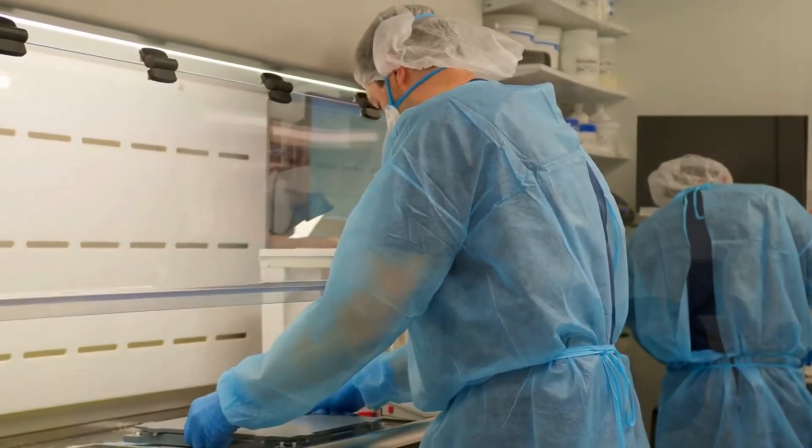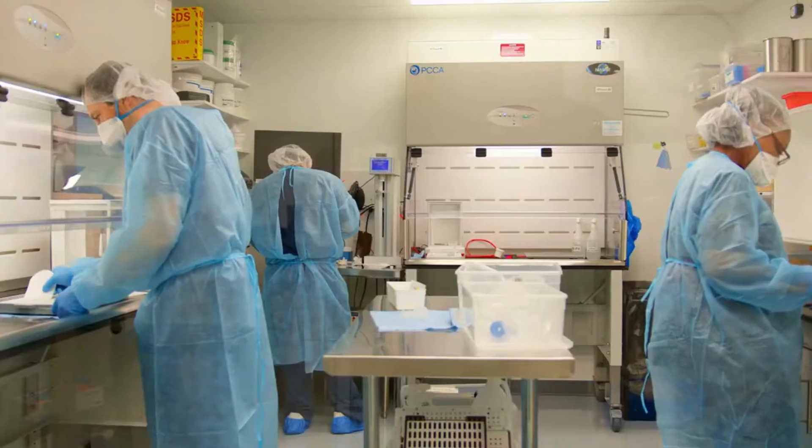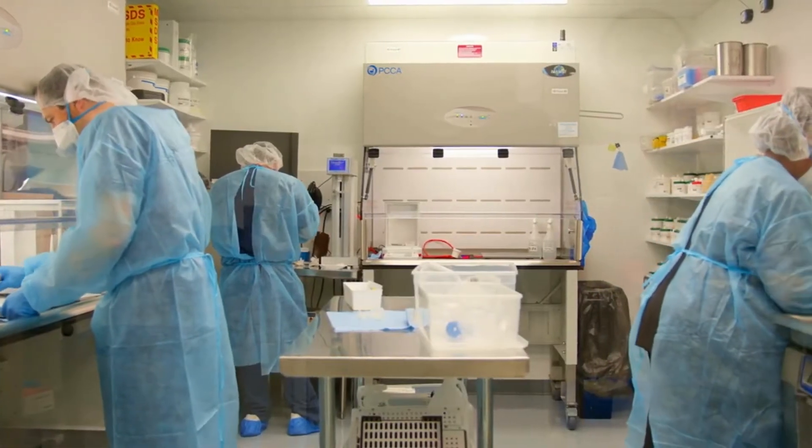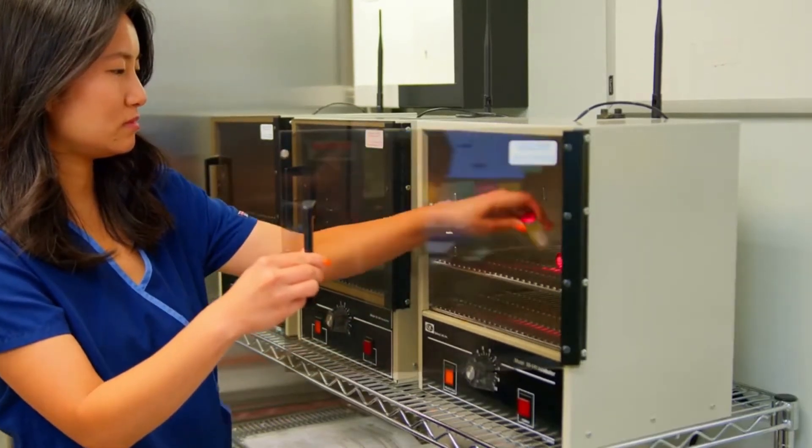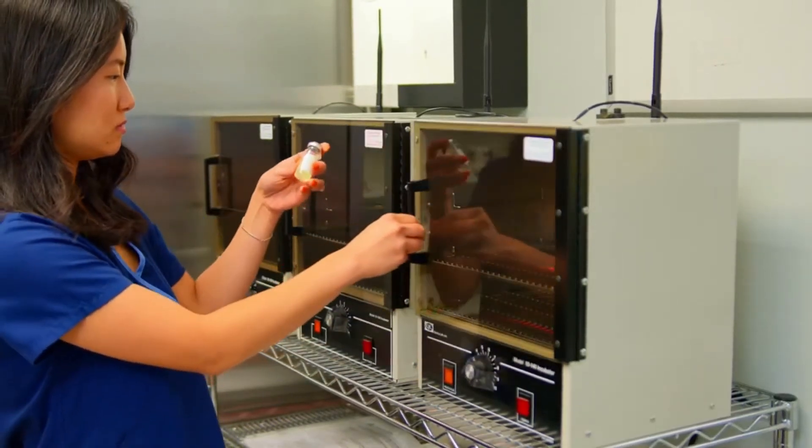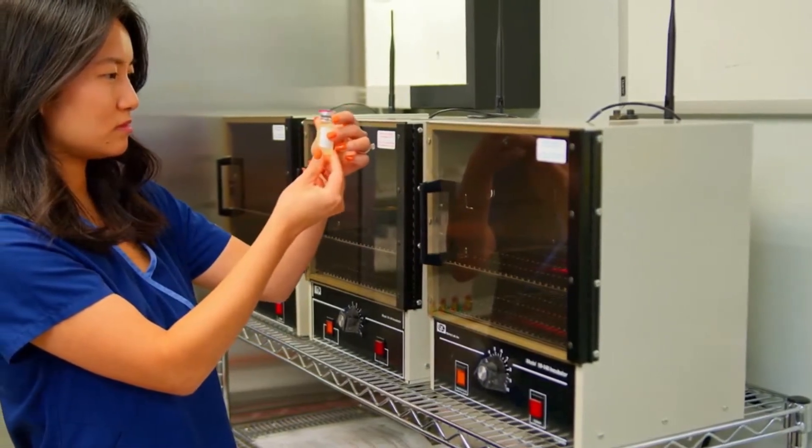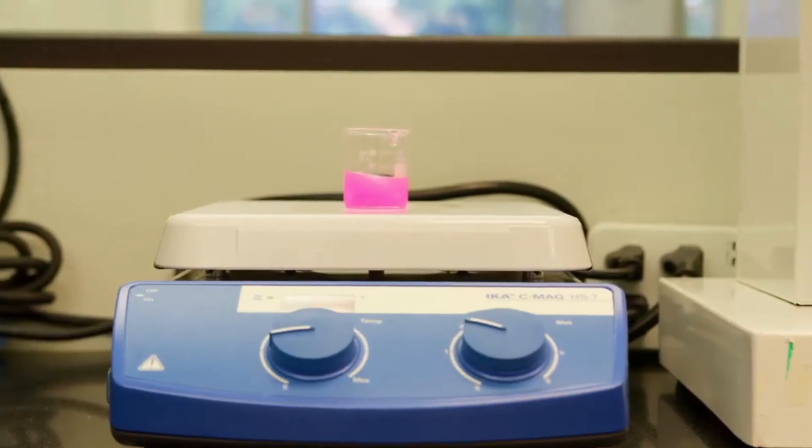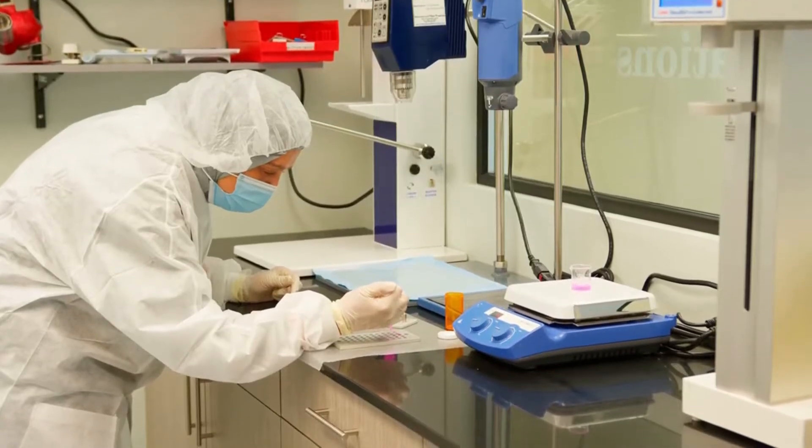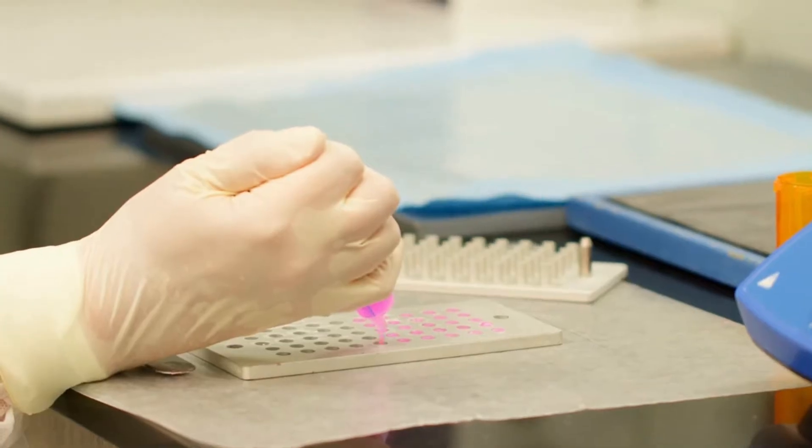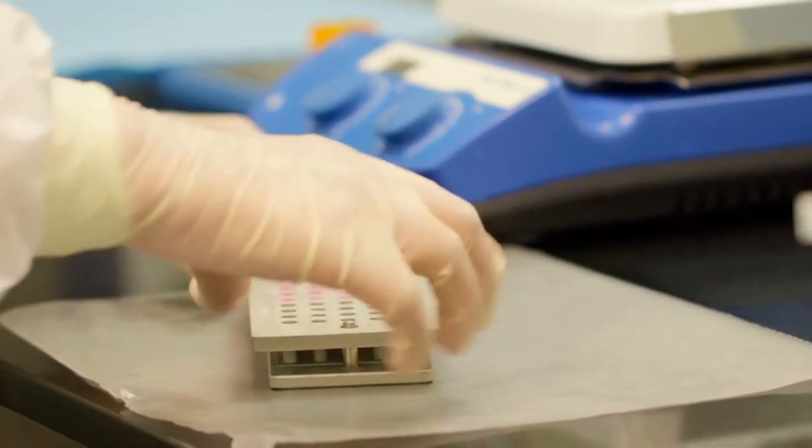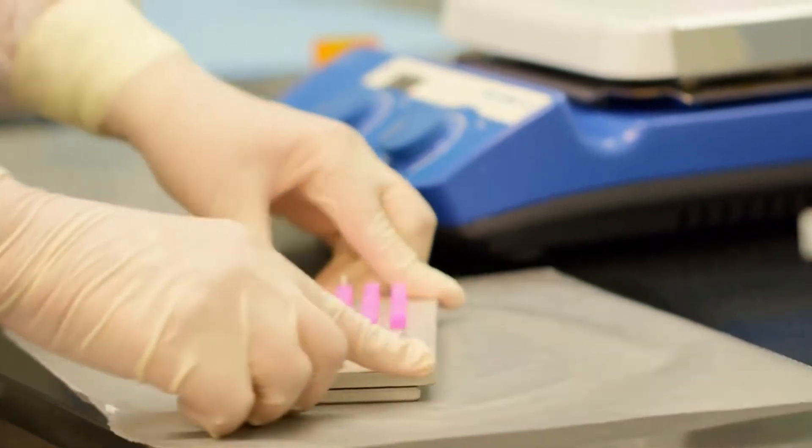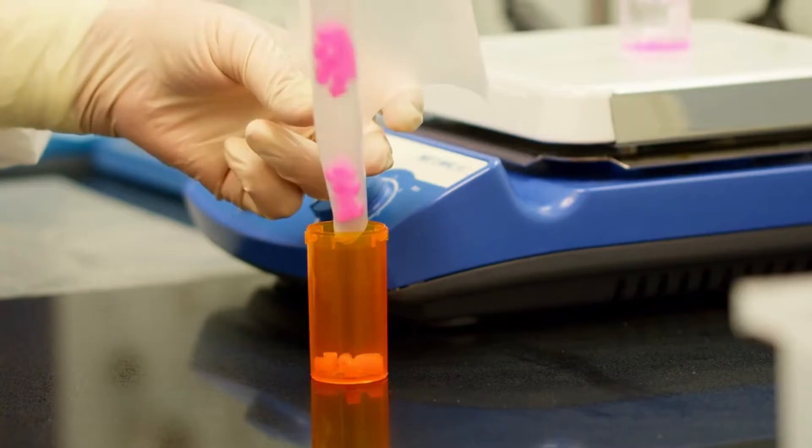We are the trusted resource for doctors that need compounded medications made to the highest quality standards. We set the highest standards to ensure doctors and patients that the medication they get from our pharmacy will produce the best possible health outcome. For over 25 years, we have built deep expertise in the science of compounding. We have developed rigorous lab protocols and undergone the stringent PCAB ACHC accreditation for sterile and non-sterile compounding. Our accreditations place us in the top 1% of all compounding pharmacies.